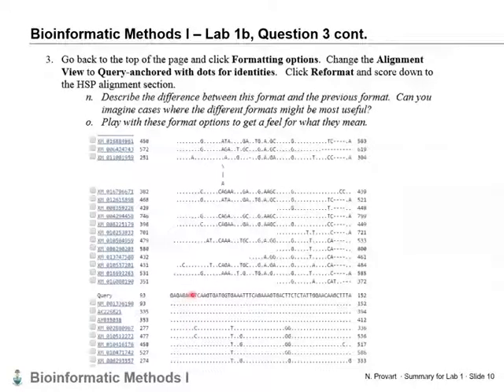So this T, for instance, has been changed to a C. This G has been changed to a T in all of those related sequences. And this kind of weird representation here denotes that an A has been inserted in this sequence. This is kind of like a poor man's version of a multiple sequence alignment. We can't really represent insertions with gaps in this particular representation, and the way NCBI's BLAST programmers have decided to represent insertions is with this depiction here.